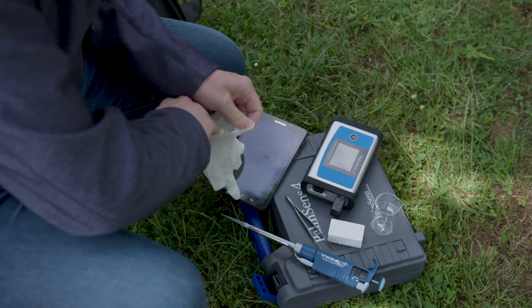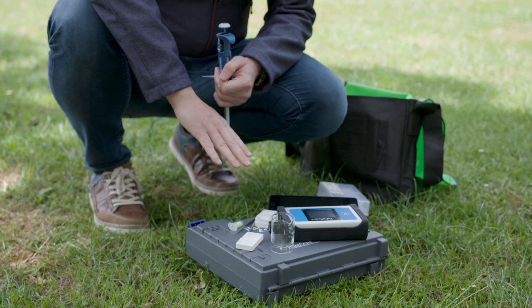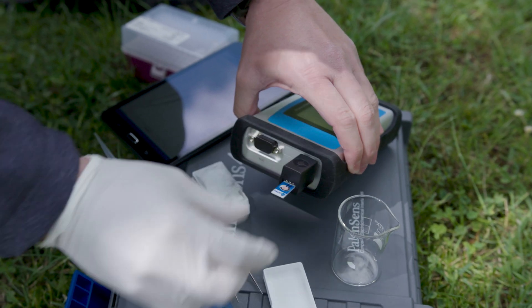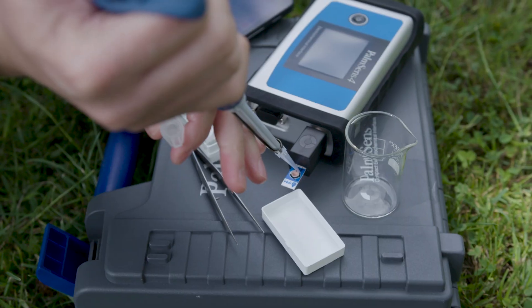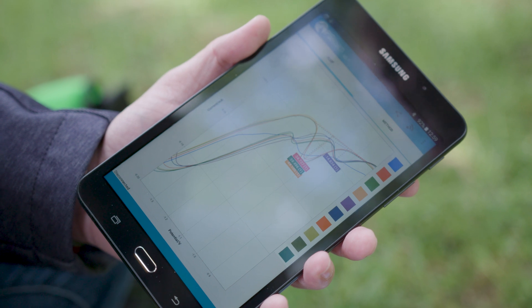Today I am going to measure if there is nitrate in the water. I am using sensors that we have received from a customer that has stood in an experimental state for measuring nitrate. I start by switching on the device, using an adapter for these kind of sensors, and I put some background buffer on these sensors to check how it looks like if there is no nitrate in it.